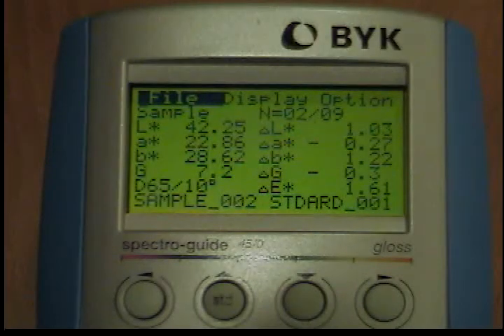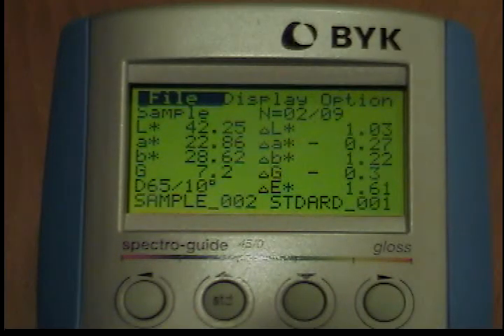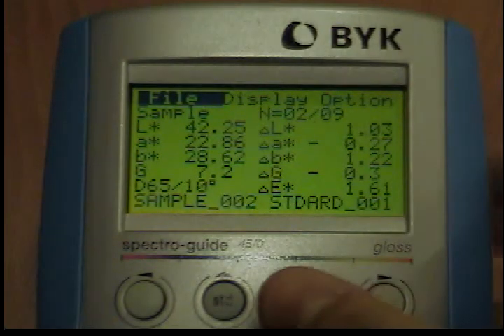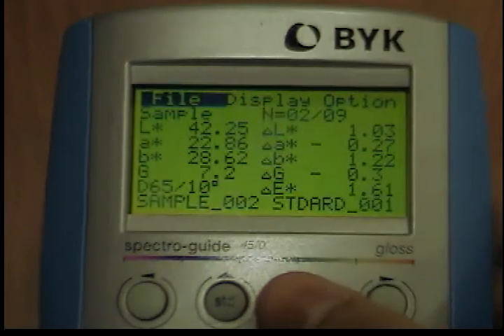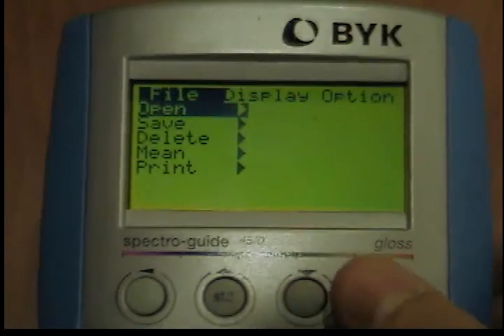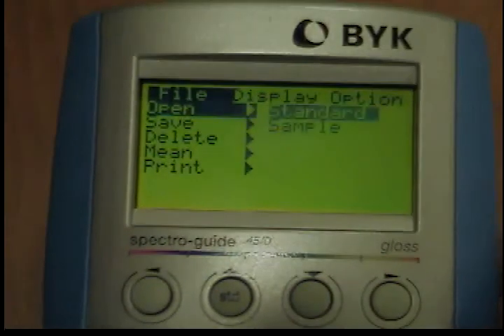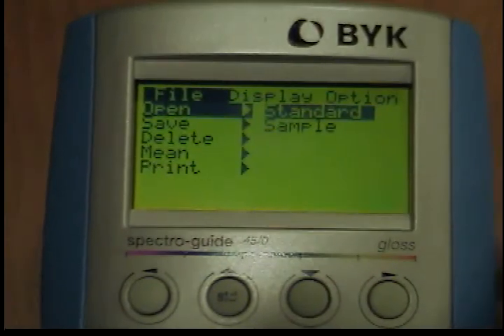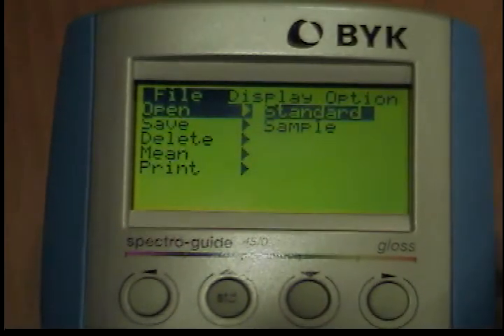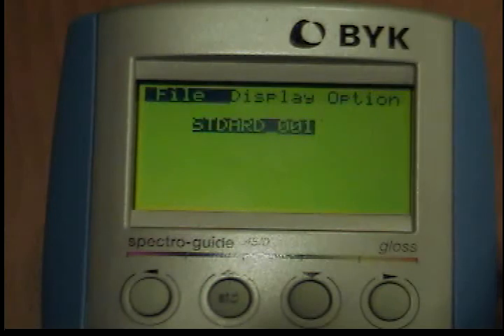Using the File menu on your BYK-Gardner Spectro Guide to open a file: in the File menu, use the Down button to move the cursor to the Open option and press the Operate button. The submenu will open. Select Standard when you press the Operate button.